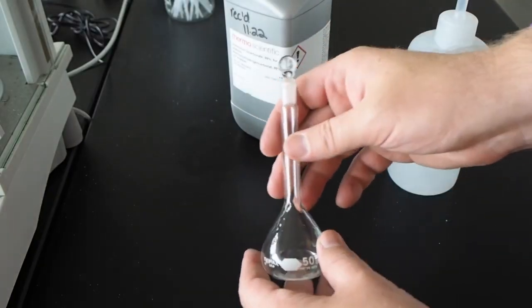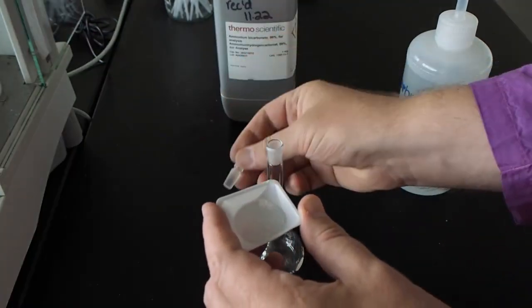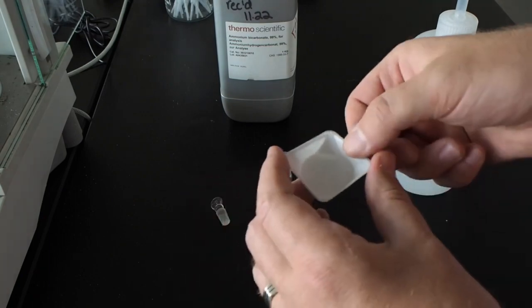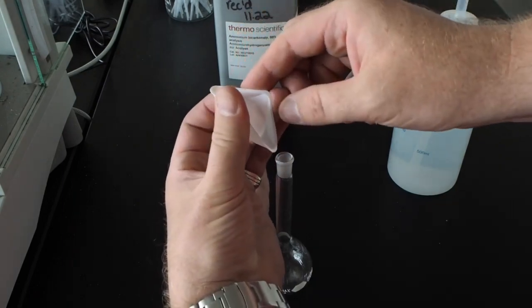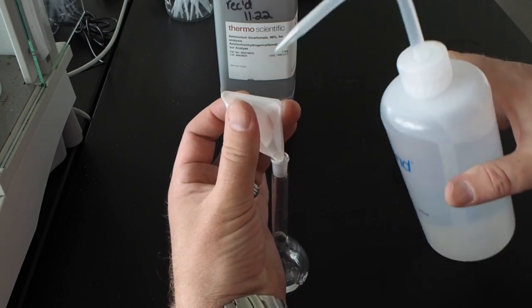So now I need to get the powder from the weighing boat into my volumetric flask. And take the cap off of here. I need to get all of those little crystals into my volumetric flask. In order to do that, I'm going to bend my weighing boat like this, it makes a little funnel. You can see some of the solids already falling down there.